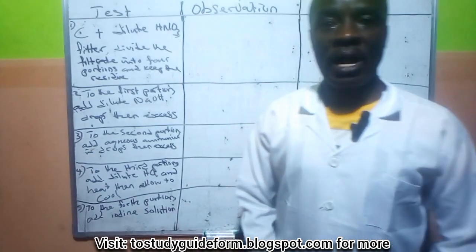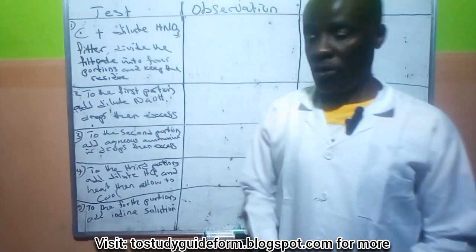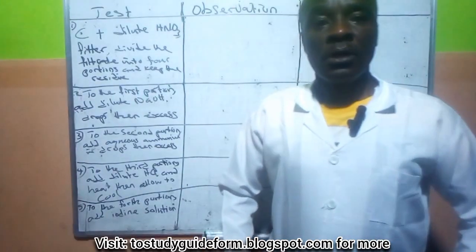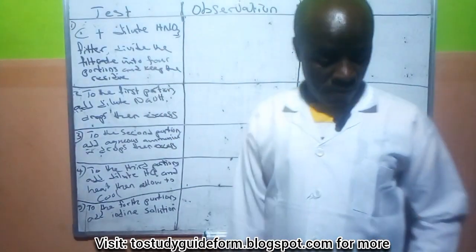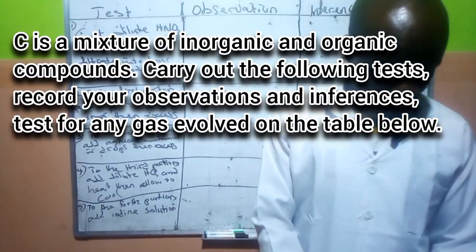So today we are going to be looking at the qualitative analysis for the forthcoming exam, that's chemistry practical. We have some of the tests here. Let me just read out the question I have. I have a question here.